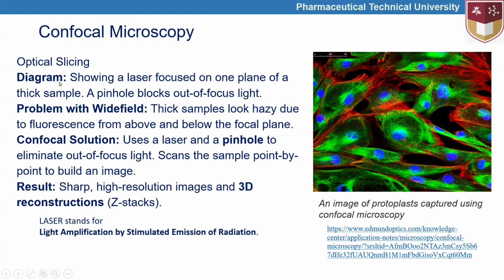Okay, and it helps us to develop diagrams that show a laser focused on one plane of a thick sample.